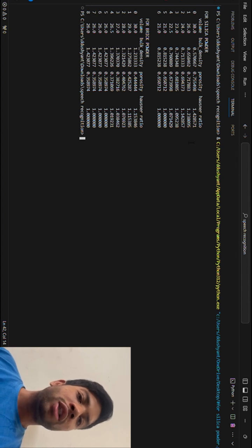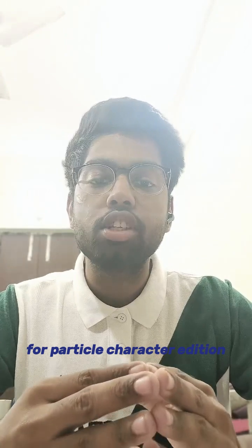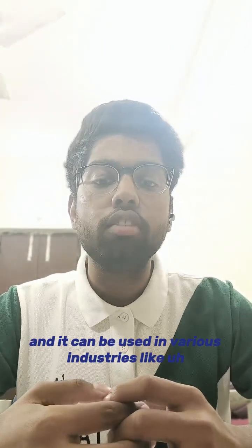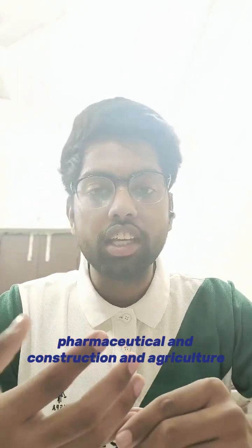Now we can compare using Hausner's ratio which is more flowable. Clearly you can see the Hausner ratio initially for brick powder was less than silica powder, which concludes that brick powder was more flowable. For particle characterization, flowability is a very important property, and it can be used in various industries like food industry, pharmaceutical, construction and agriculture.